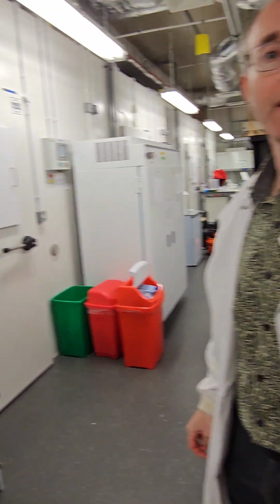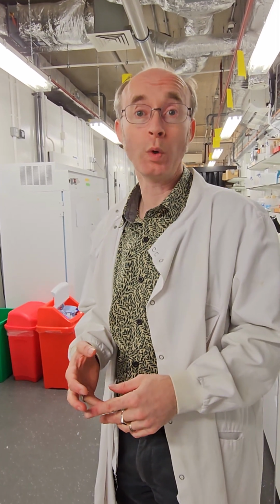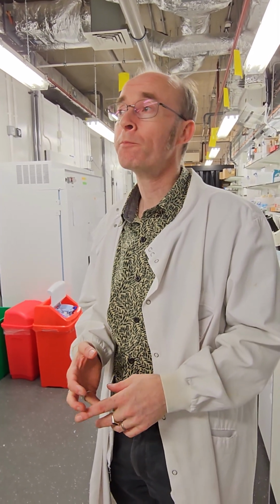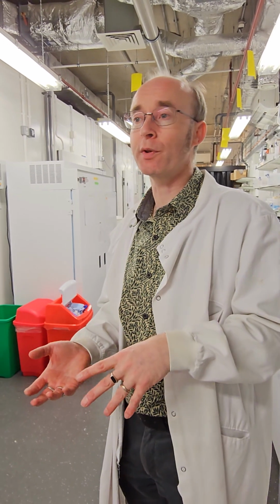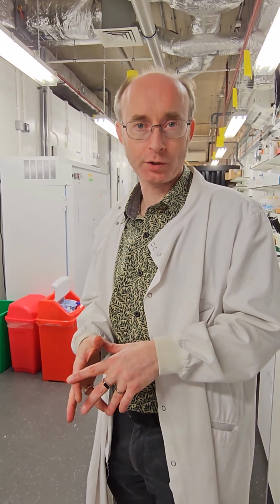That we have are these Galleria mellonella. They're the wax moth. And we're using those for a slightly different set of experiments, because fruit flies are very good to understand the basic biology, cell biology, how cells work and function. The wax moths are a much better model for immunity and infection.